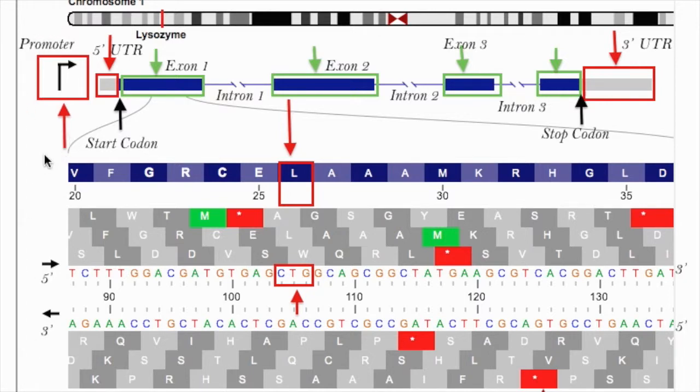Now let's go ahead and see what we have in the gene view. This part is very important to know because it's the basics for every problem that you solve. So first, we have the promoter region right there. This is the promoter. There's an arrow pointing to the right. Then we have the 5' UTR, which is the gray right there. UTR stands for the 5' untranslated region. Then when you come down here, this small part will show you the start codon.